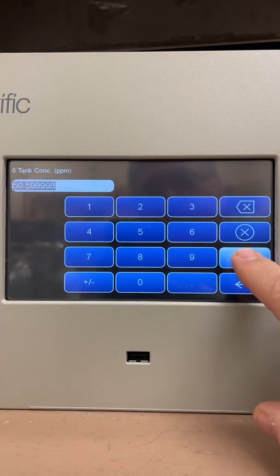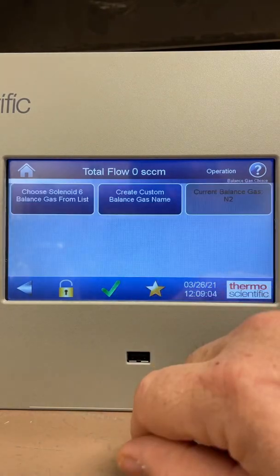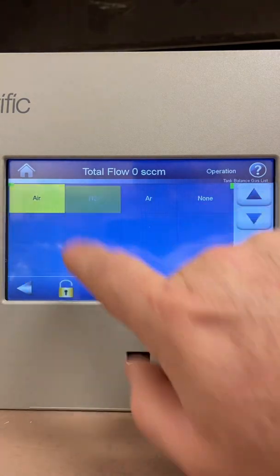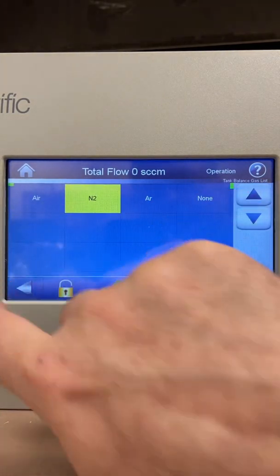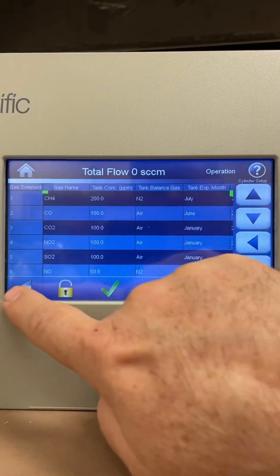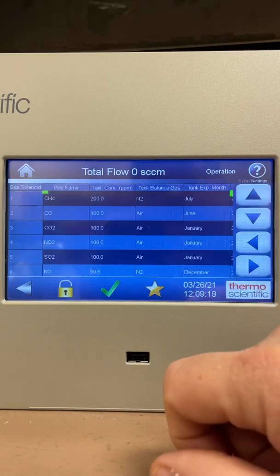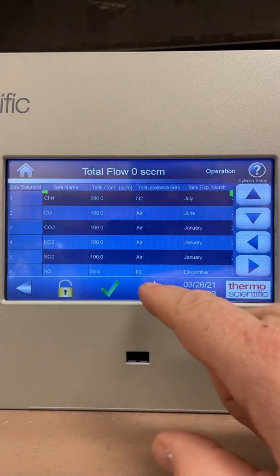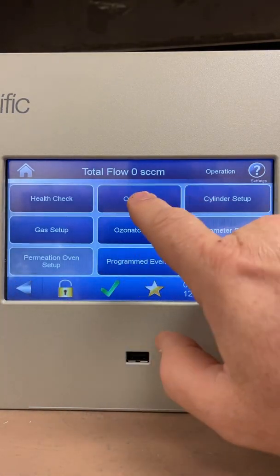The balance of the tank is nitrogen, and you can pick from a list whether it's air, nitrogen, or argon — it's nitrogen so we'll leave it. Go back, and that's your cylinder setup screen. So NO on solenoid number 6 for GPT is the one thing you have to remember to do.